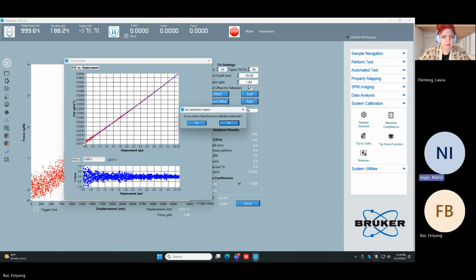So in this graph, you can see a lot of variations happening here. Does that mean that until 1 micron, it is having some issues or it's not good? It just means that there is some noise getting into the system, either vibrational or acoustic, or even your HVAC blowing on it can cause those kinds of low frequency vibrations.